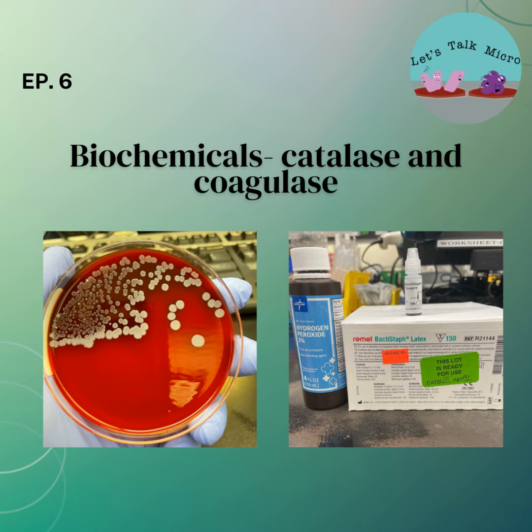I also talked about how helpful it is when you have white colonies. Let's say you're in the urine bench, you have these white colonies. A quick wet mount, you can see if it's Corynebacterium, gram-positive rods. You can see if it's yeast. When you have alpha colonies, you do a quick wet mount, you can see the gram-positive cocci in chains. Granted, with that, you might have some difficulty sometimes. You can see the gram-positive rods, the long thin rods, which are indicative of lactobacillus. And in that case, it will be normal urogenital flora.